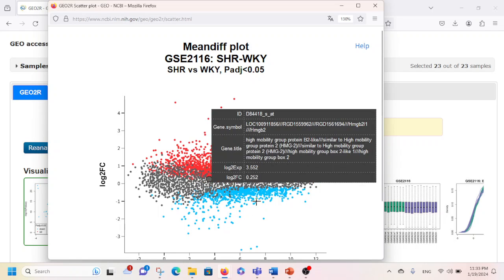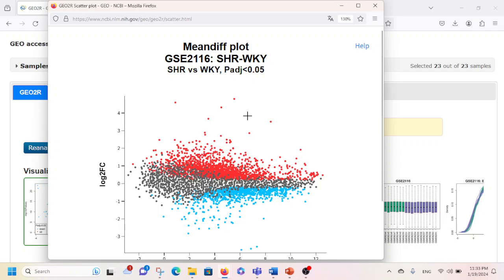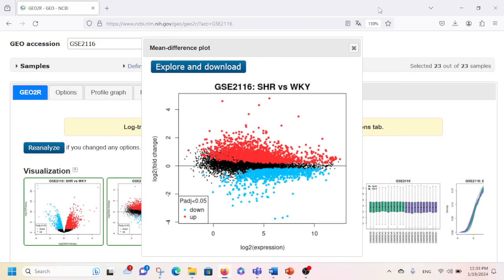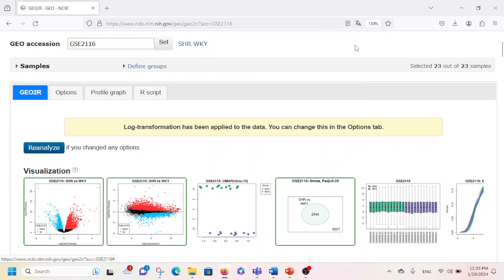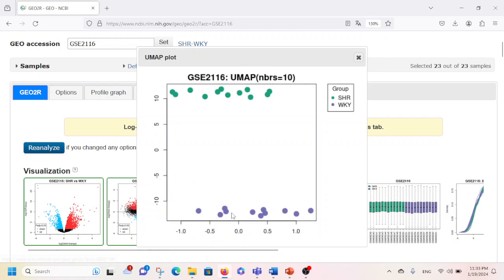I'm going to close this window too. Here in this graph a UMAP plot has been shown. You can see that the bubbles appearing in the upper area represent the SHR group, whereas the bubbles in the lower area represent the WKY group.